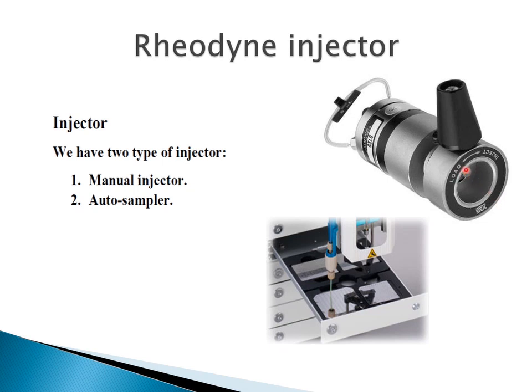So once we inject the standard by certain syringes, it will again fill the same volume here, so the volume will be kept constant. So there is no variation due to the volume, and instead the variation of the peak area will be just for the real content of the sample in the mobile phase, reflecting the concentration of the material.